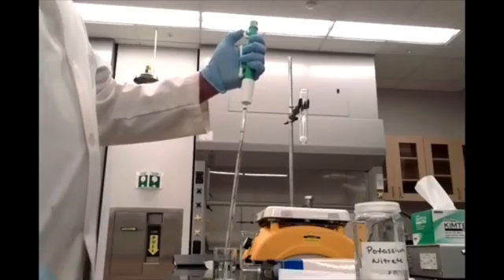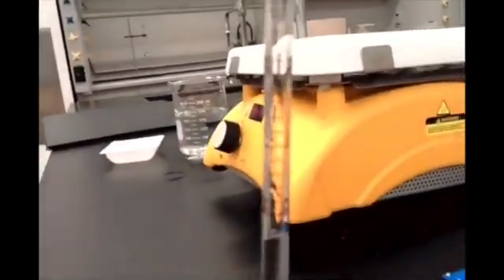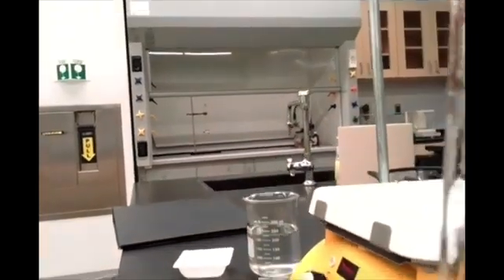I don't know if you can see this very well. Maybe if I pull this a little closer, you can see that as I turn the wheel, I'm drawing water up into the pipette. Now, I want to try and get this to the 0 mark on my pipette.